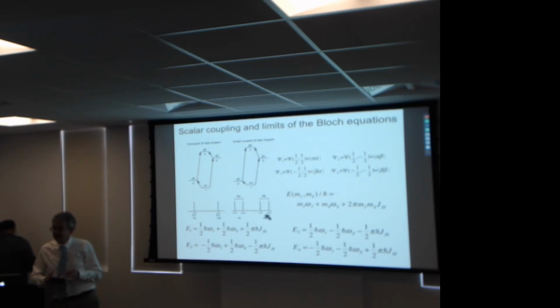This is the nitrogen spectrum. One of these resonances is the nitrogen 15 magnetization, where the amide hydrogen is alpha, and the other one is the nitrogen 15 magnetization, where the amide hydrogen is beta.